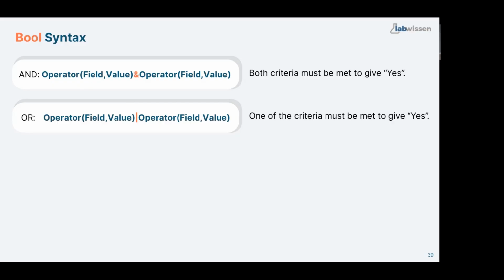When I lived in Germany, it was next to Y. Now I have a Swiss keyboard, and I have it by 7. I don't know how it works on a French keyboard or an American keyboard or in India. I have no idea, but you can also find it when you put in a formula entry. You also find this symbol in operations.